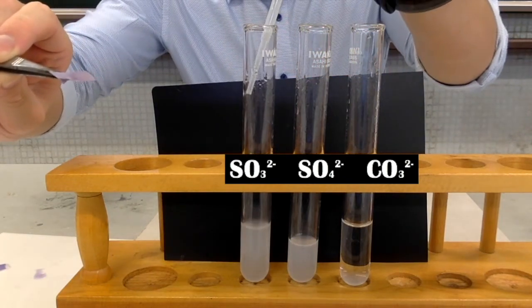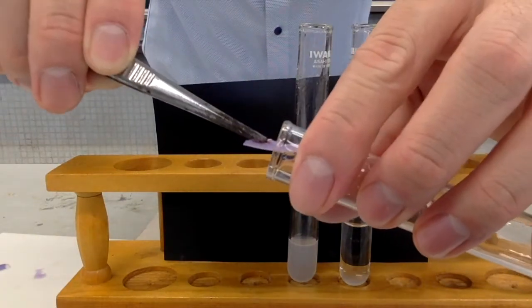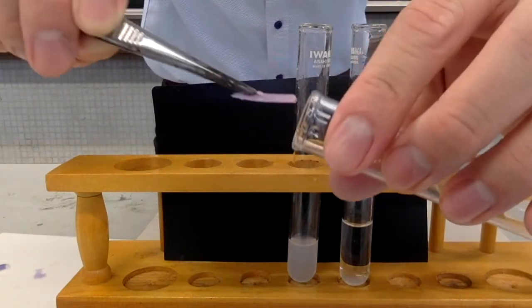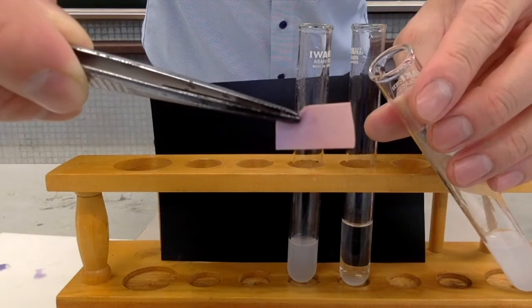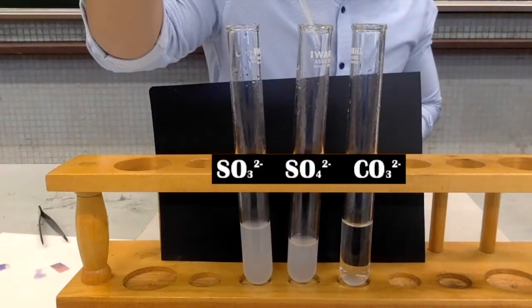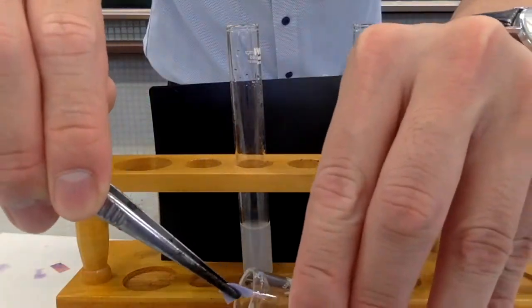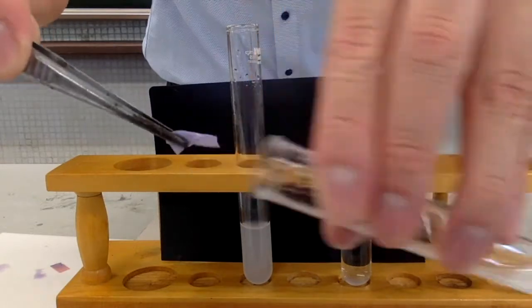Add dilute hydrochloric acid into a sample containing sulfite ion and place a moist blue litmus paper near the mouth of the test tube. The gas produced will change the moist blue litmus paper from blue to red. A similar procedure was repeated with sulfate ion, and the moist blue litmus paper doesn't show a color change.